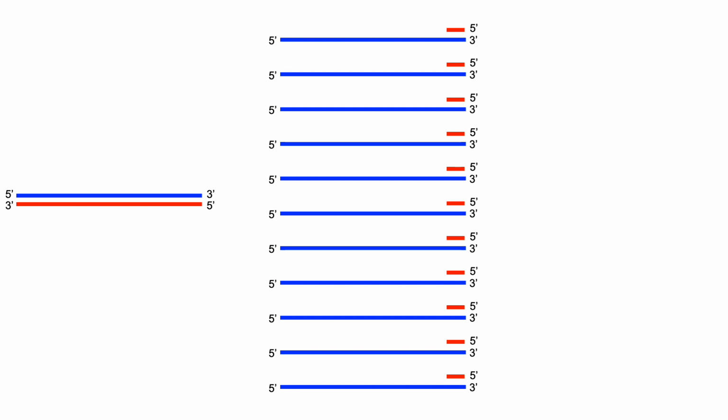Then let's just say, for example, this is the reaction mix that has the ddATP, the dideoxy ATP. So anywhere there's a T on the template strand, it could potentially stop the growth of the new strand because it can put in a ddATP and that will stop growth.